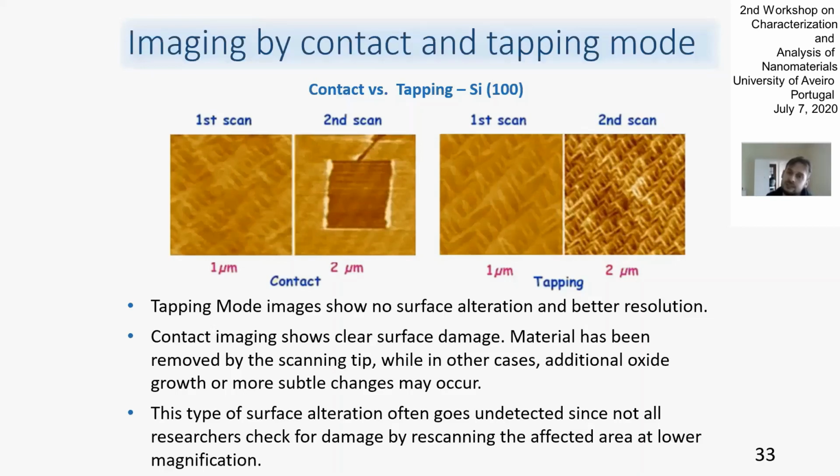And that actually makes sense for nanomanipulation. If you need, you can modify your objects by the contact of the tip with the surface. And if you just need to visualize, you may use the tapping mode only.